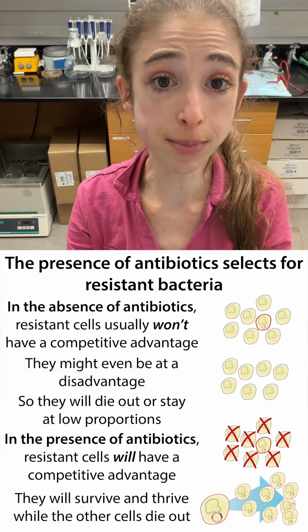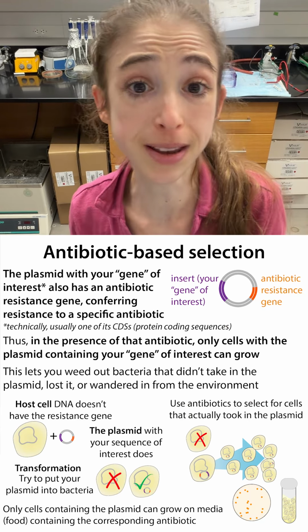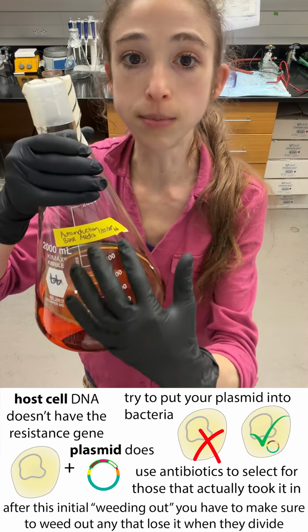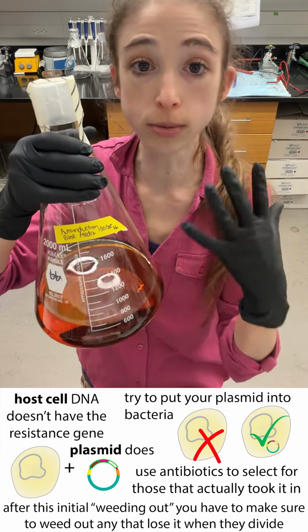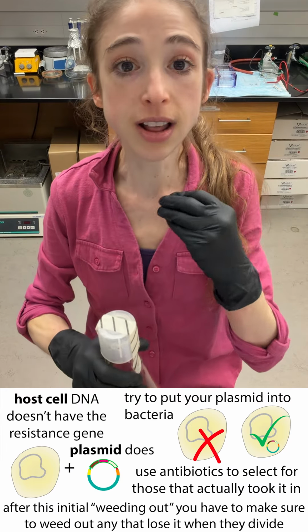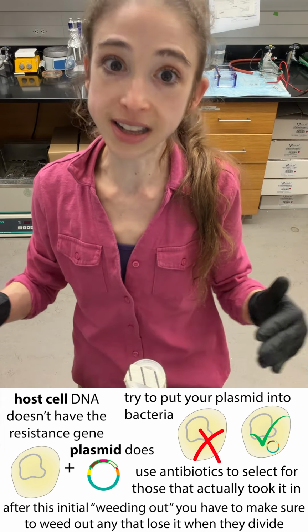And this is great because now we're only feeding the cells that are actually going to hopefully be making our protein. It's important that we can then add the antibiotic in whatever culture media we're growing it in once it's taken in that plasmid, so that we keep alive the ones that keep the plasmid and kill off any that lose it.